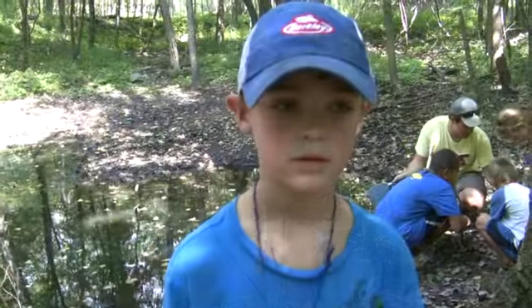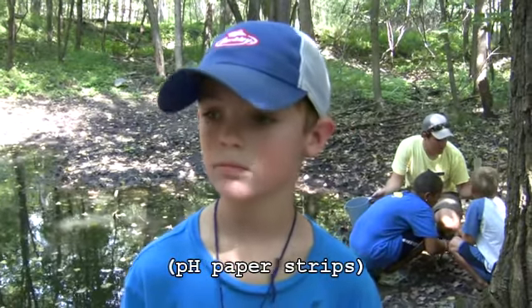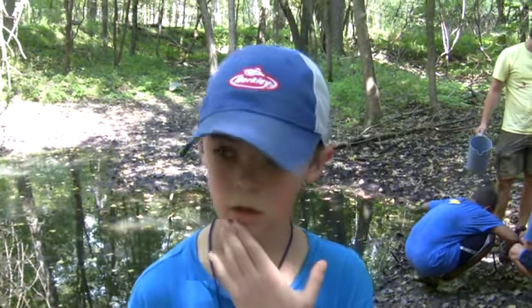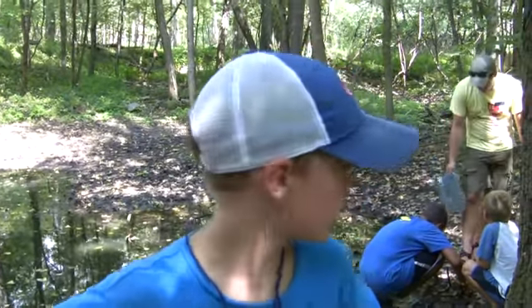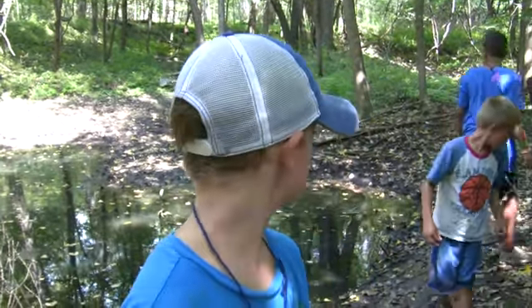Okay. Cool. And I hear you get to maybe take some of the papers home with you at the end of the day? Yep. What is that for? I am going to look for a lake or a pond or a river close by and see what it's like. I'm going to write down the colors because it changes the color when you put the strip in. And I'm going to write down the colors so I know what they mean. Okay. Yeah, that's what I'm going to do. Okay.